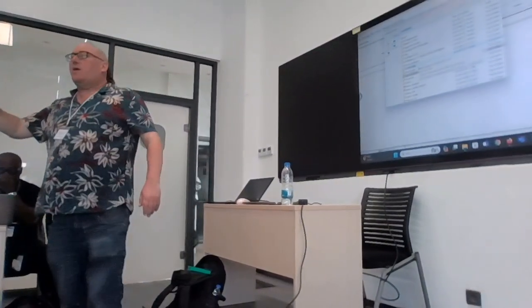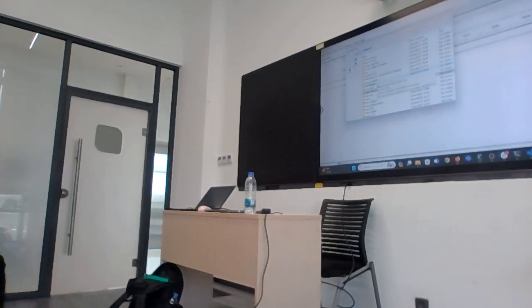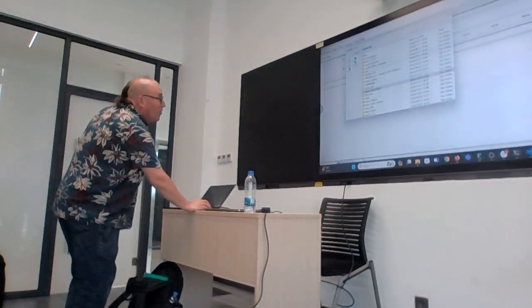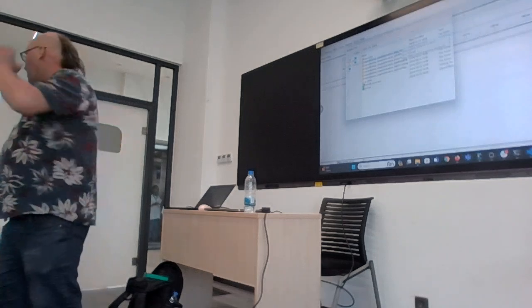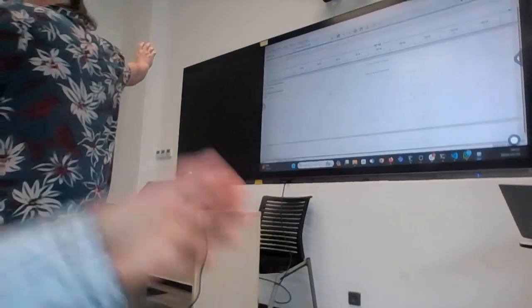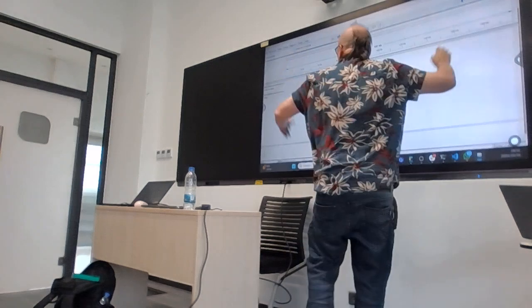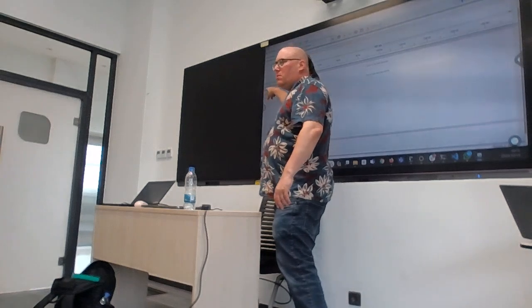So then I go look for my analysis output. I see that some people have been busy and they did so much mpox analysis overnight or something. No, seriously. There's people with lots of analysis they've done already. And I'm going to go in my mpox output and I'm going to find the align trim folder. Okay, align trim. Let's see what you got. The first thing that you see, you don't see anything here because it can't show the whole genome at once, but you see something has changed here.